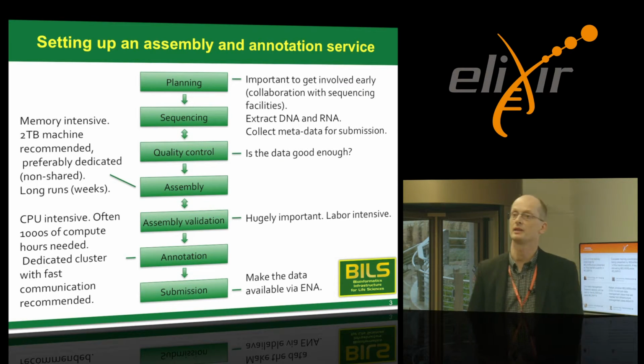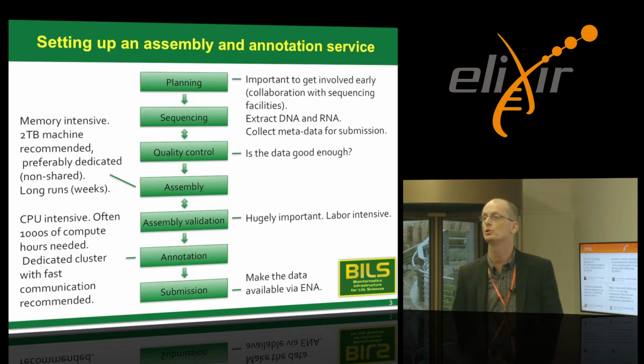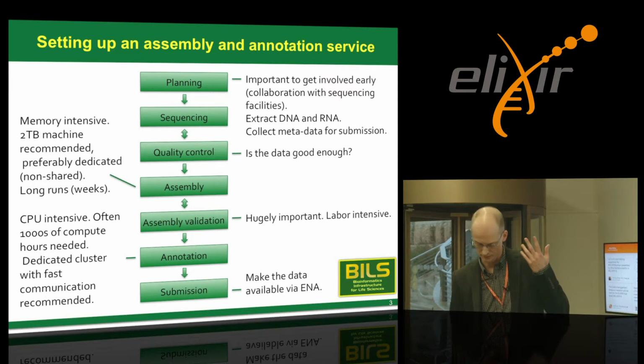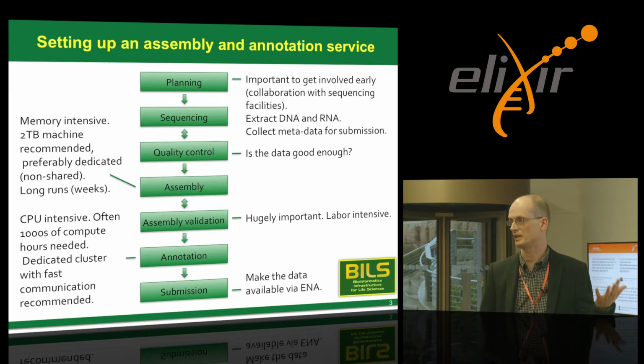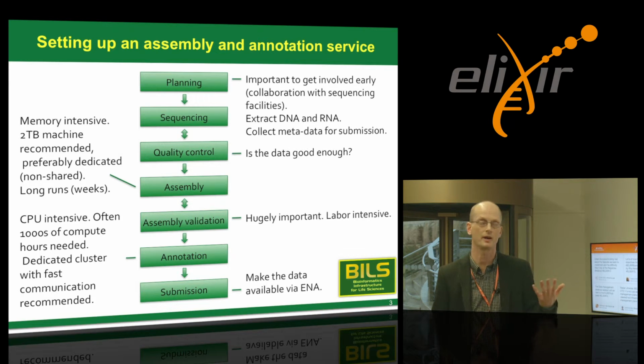Assembly is the memory-intensive part of the procedure. We have a 2 terabyte machine, and that is usually enough, but not always. And the program can run for 2 to 3 weeks easily, so you need to have dedicated computer resources to do the assembly for large eukaryotes at least.